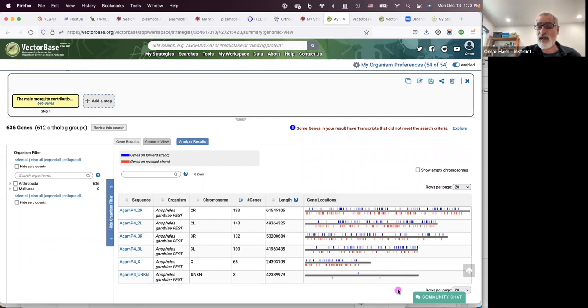Depending on what you're asking, for example, if you're looking at something like Plasmodium, where there are variable genes, or in trypanosomes, and your search ended up returning genes that are actually VAR genes or VSG genes, you might find that they're clustering in certain parts of the chromosome, as would be expected, like in subtelomeric regions. So that's a nice and quick and dirty way for you to see the distribution of the genes across the chromosomes.